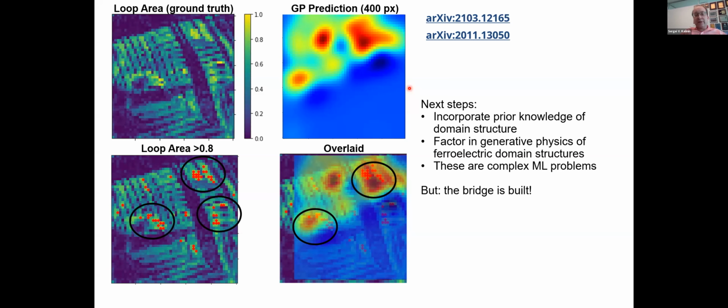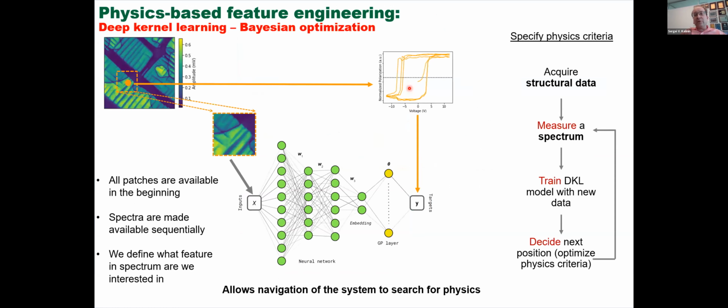So why does it happen? It happens for two reasons. First of all, Gaussian processes rely on the kernel function, which is essentially a discoverable correlation function. And secondly, in a real experiment, we never run a black box experiment. We have access to some information channel, and then we use it to do the discovery on a more detailed information channel. It turns out that Gaussian processes can be naturally combined with deep learning networks to produce what is called deep kernel learning. And these techniques are super useful for building the structure-property relationship.